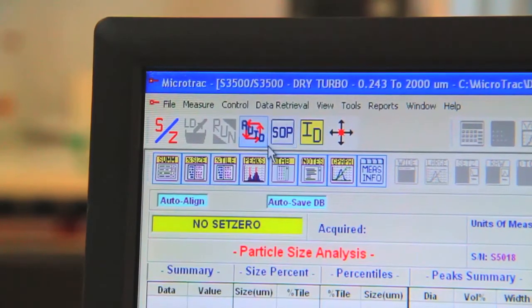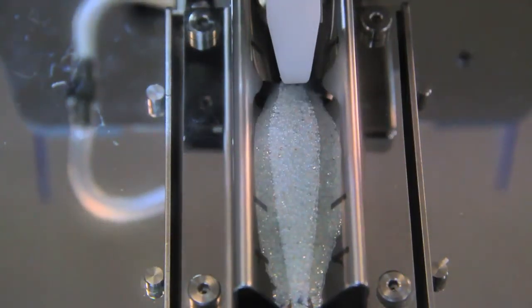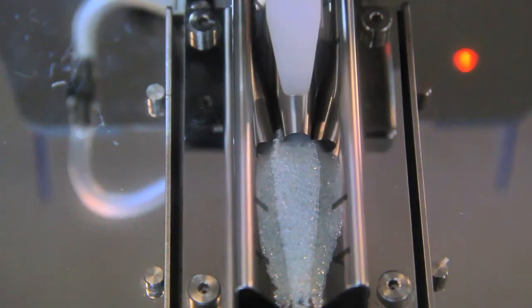Click the Auto button on the FLEX software to begin the analysis. A background check will be initiated prior to the analysis to ensure that the system is clean.